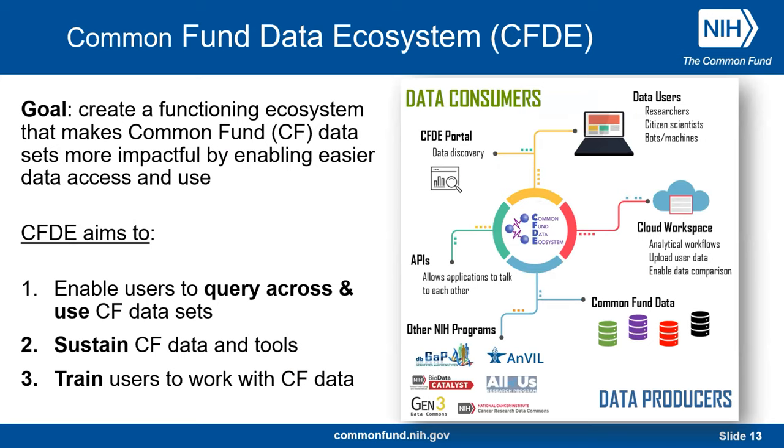Now, Roger touched on this. So the xRNA Atlas right now contains RNA-seq and qPCR data. We want to expand it to other data types, which we'll be doing for stage two as those technologies continue along development. One that we are adding now is EV flow cytometry data. So that'll be another data type within the Atlas.